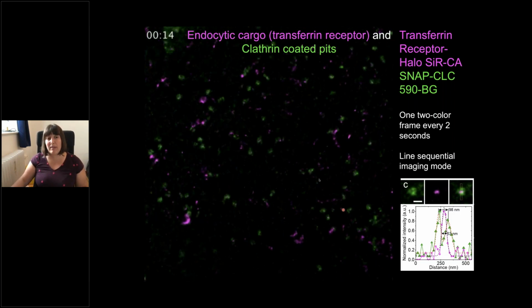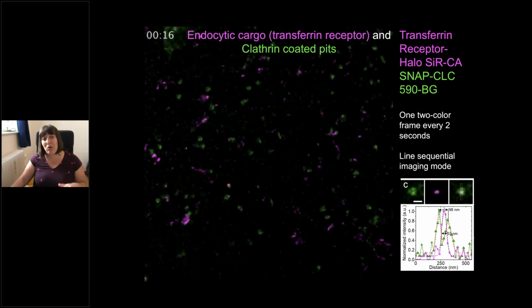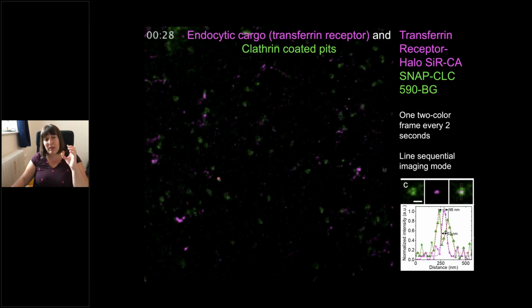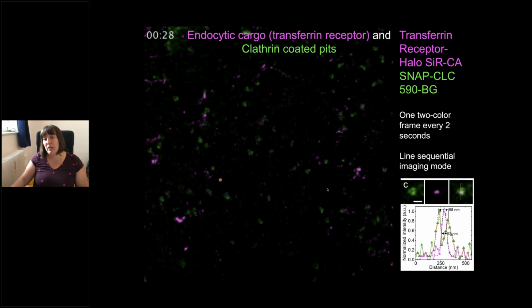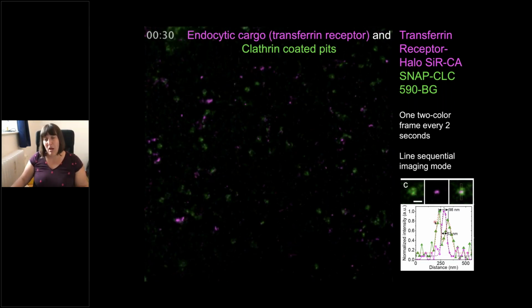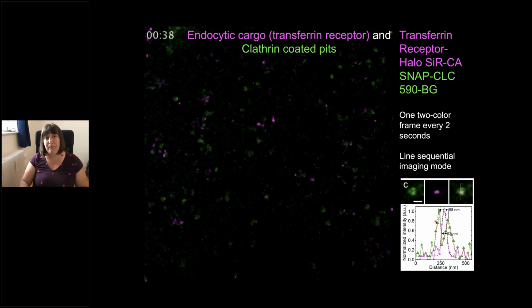And we performed our live Cell STED experiments, and you see all these little tiny donuts, which are clathrin-coated pits, wiggling around on the plasma membrane. For example, down here you see a little clathrin-coated pit, which is filled with cargo that is being endocytosed. And again, these structures are only around 100 nanometers from membrane to membrane. So super resolution is really necessary here.